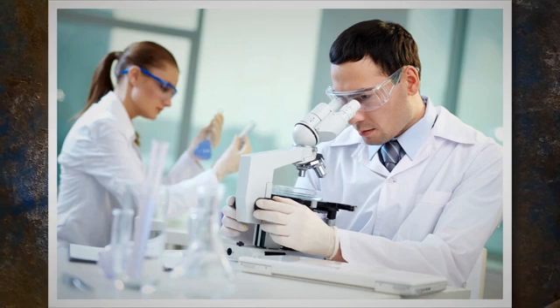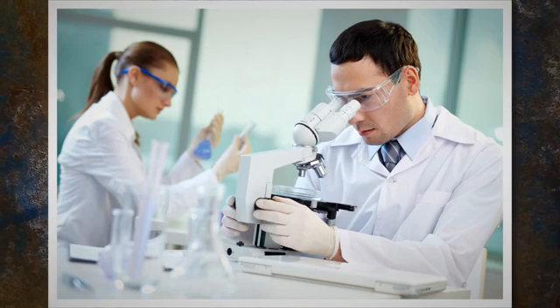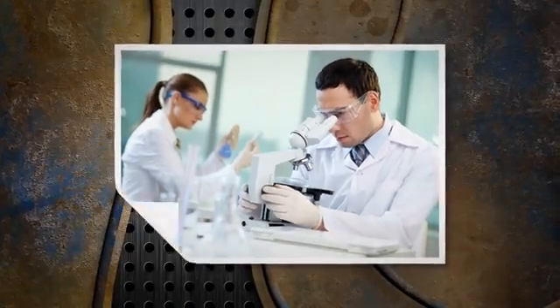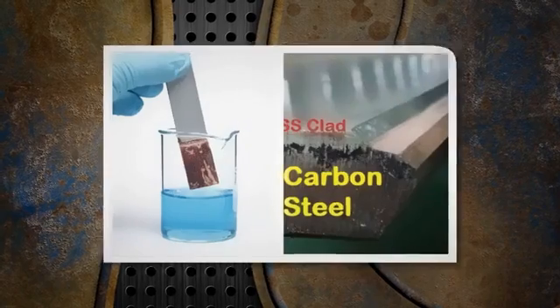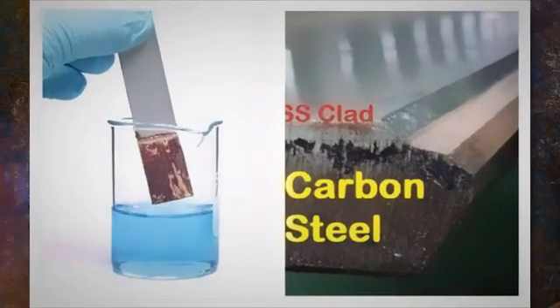The test works on the principle of oxidation-reduction chemical reaction that causes the dissolved copper ions to settle or stick to the iron present on the surface. Copper sulfate solution is applied by swabbing or brushing to the surface of interest, and if any iron particles are present they will react with the solution and change to a brownish color.